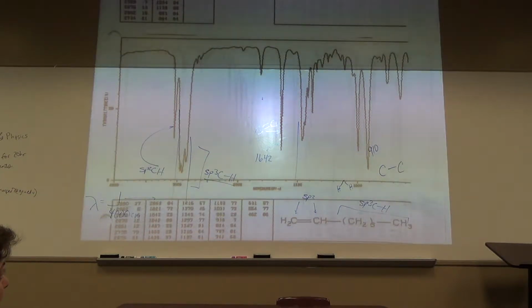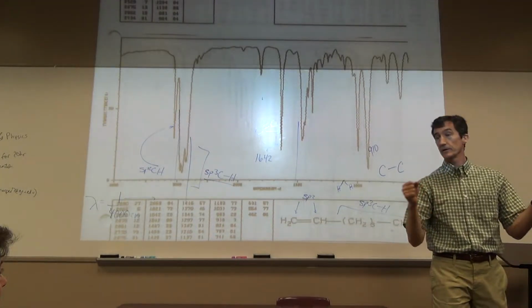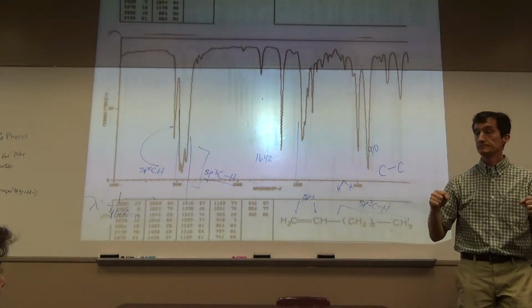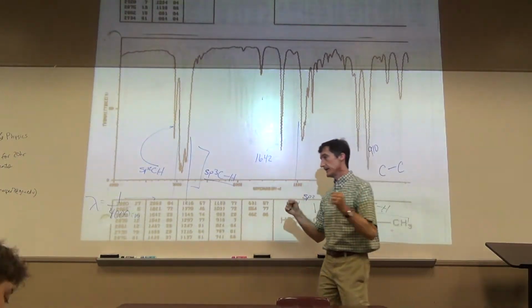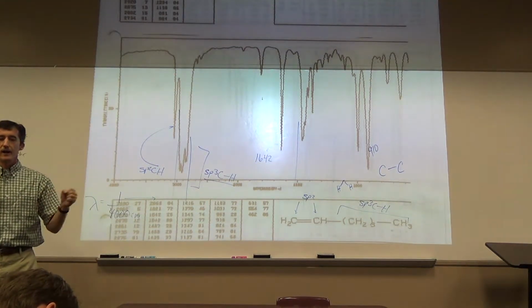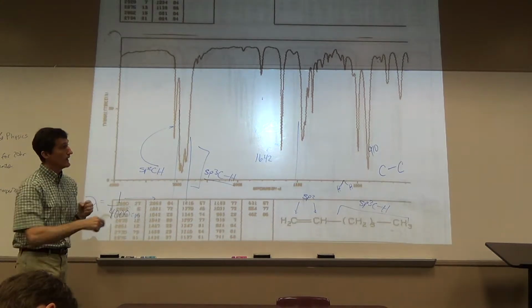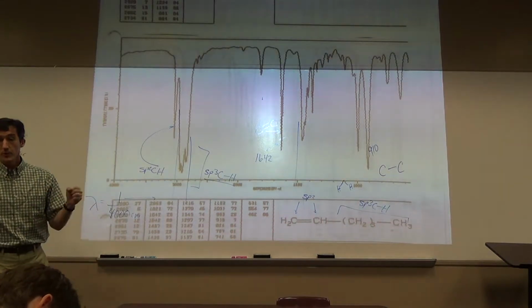What is an overtone? Maybe that's the CC single bond, I don't know. Okay, then you throw some IR light at me. I go up here and I absorb that amount of energy. And there it is, there's the absorbance.